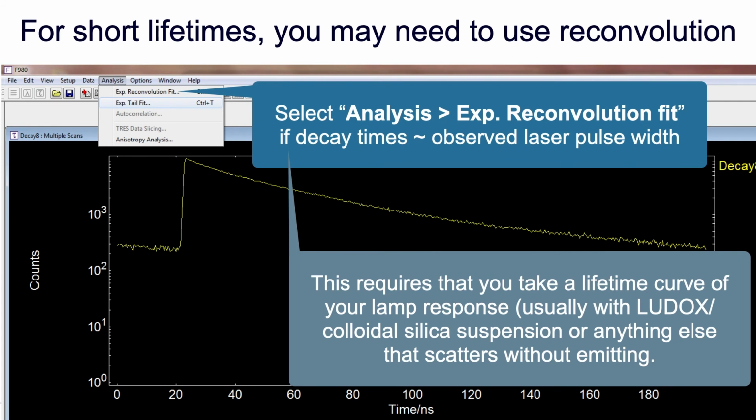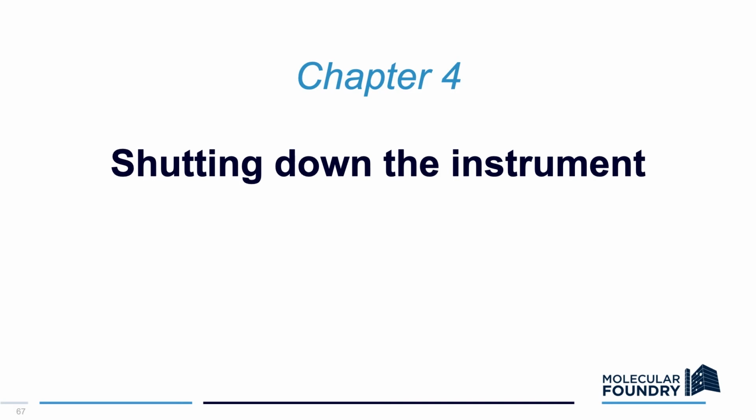Usually you would do this by placing a colloidal suspension of Ludox or silica nanoparticles, or realistically any other thing that scatters light. So that's measuring the lifetimes. You can see it's very simple in this software. Once we're done, we can shut down the instrument.